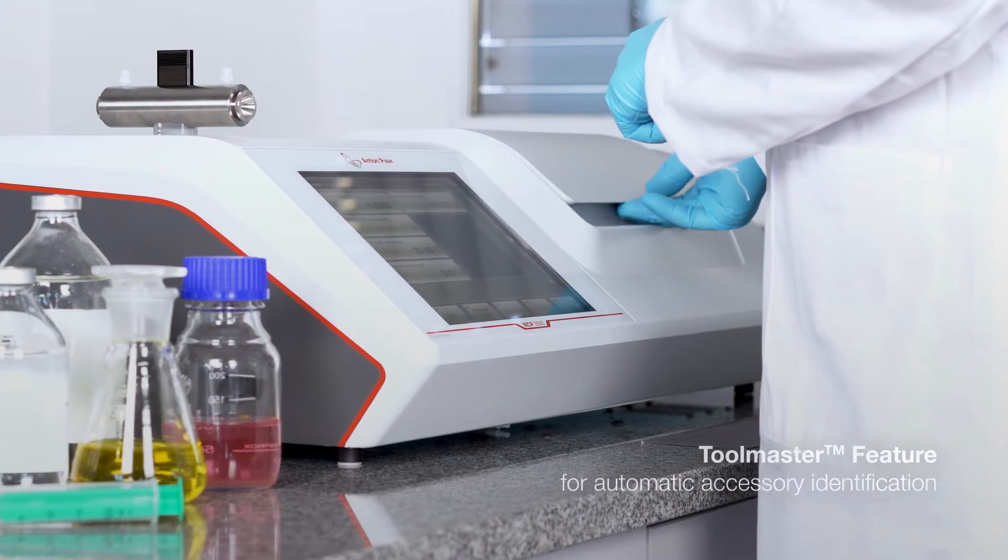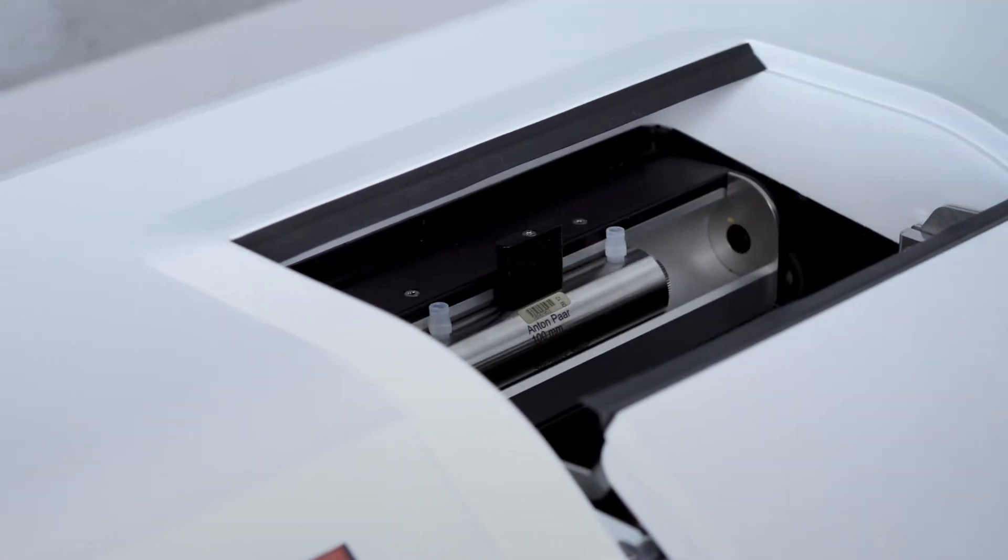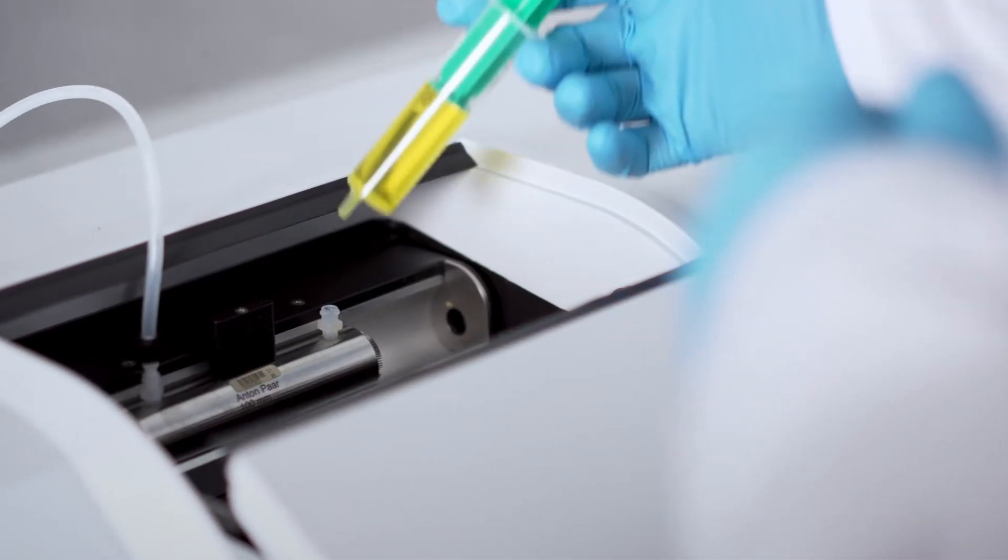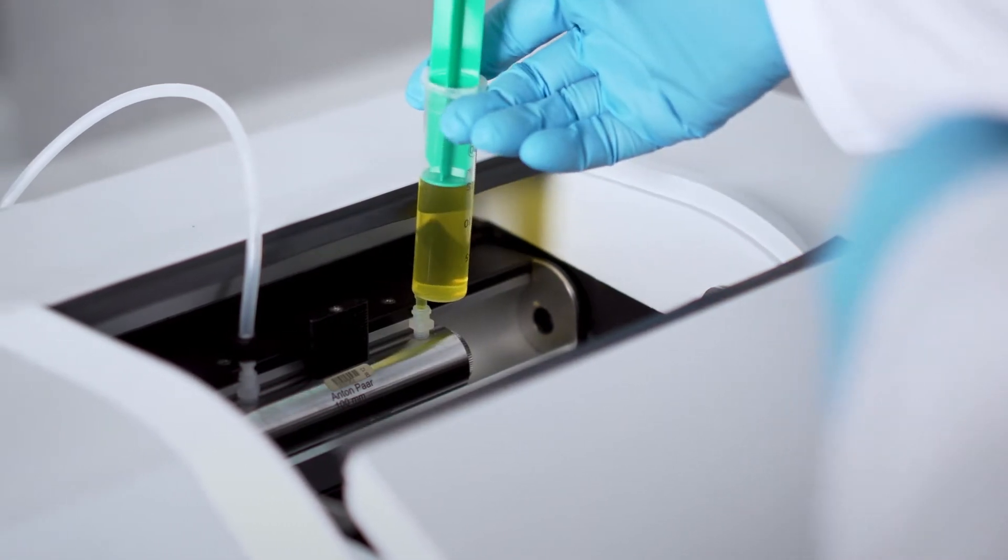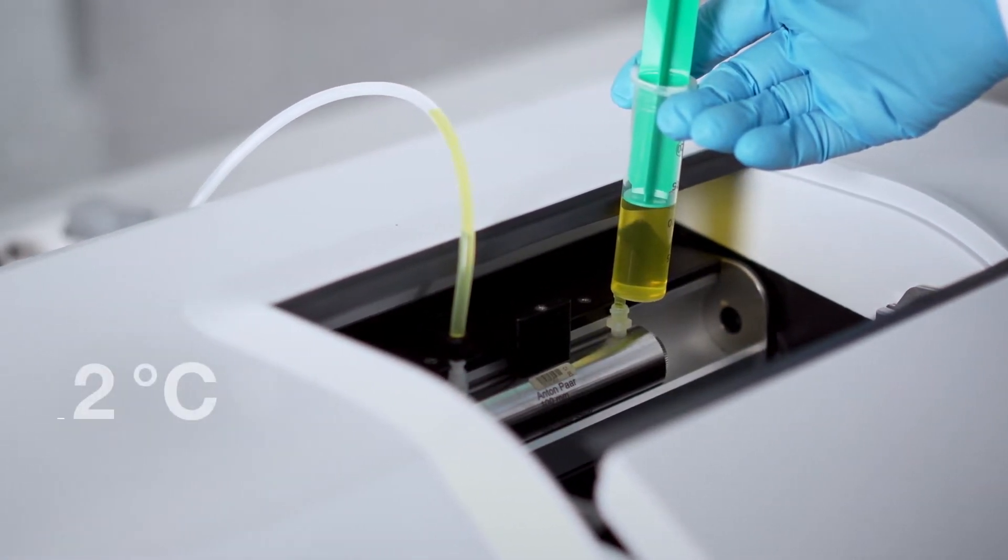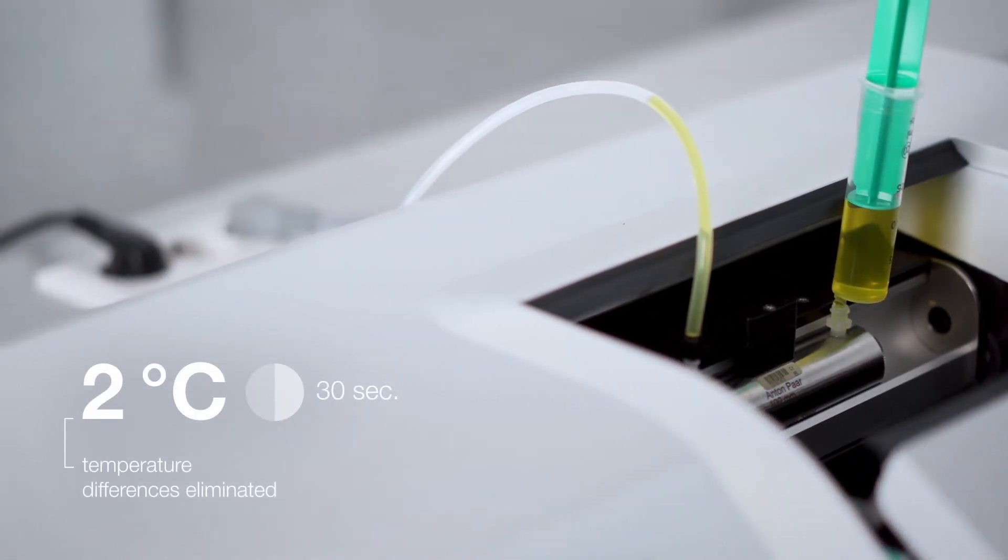The Toolmaster feature automatically identifies accessories and guides workflows, preventing errors before they occur. The world's fastest, most precise Peltier temperature control in a polarimeter eliminates sample temperature differences of 2 degrees Celsius in less than 30 seconds, reducing cycle times.